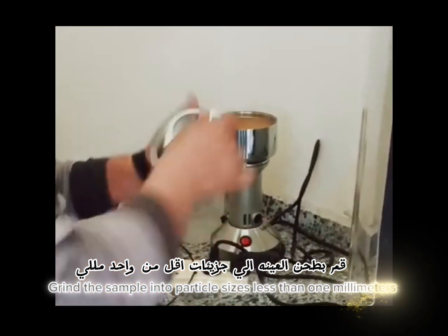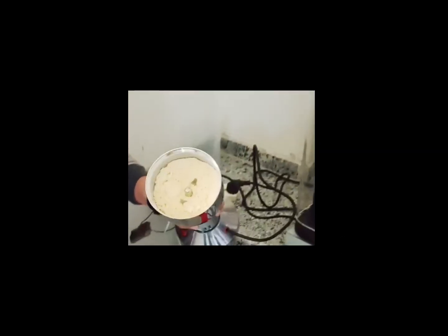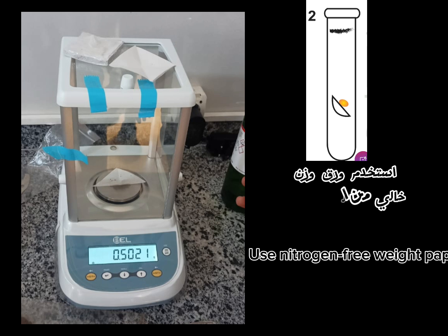Grind the sample into particle sizes less than 1 mm. Weigh half a gram of the sample using a four-digit scale and place it in the tube. Use nitrogen-free weight paper.